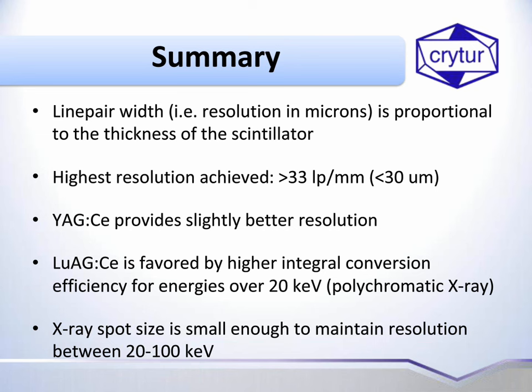Do you lose light when you press the scintillator fiber plate to the fiber on the camera? Well, I think Colin wanted to add something.